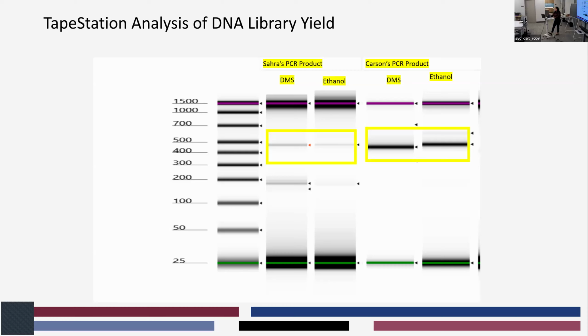The MAP reverse transcription step is a very delicate procedure, and I have been told that for people who are starting to work on making DNA libraries, it's usual and common to run into this challenge. So I repeated the reverse transcription step several times. I checked each step carefully. I corrected small differences in sample handling that could affect the yield.